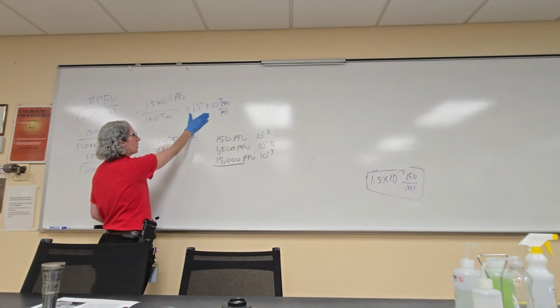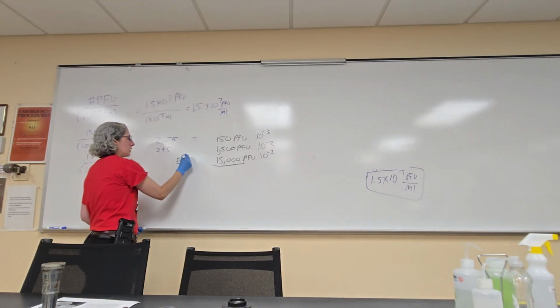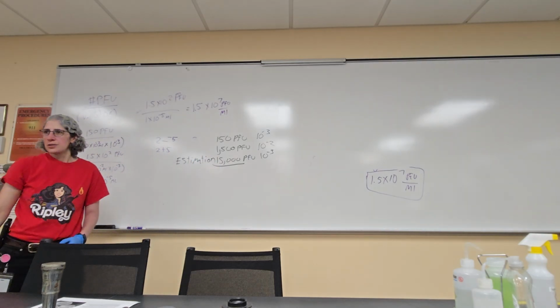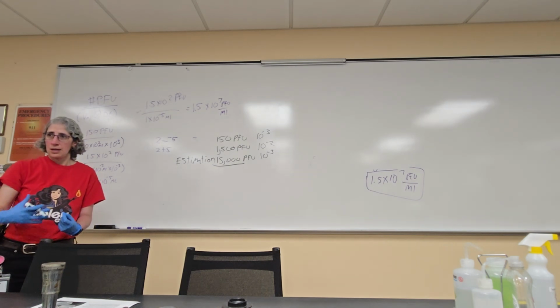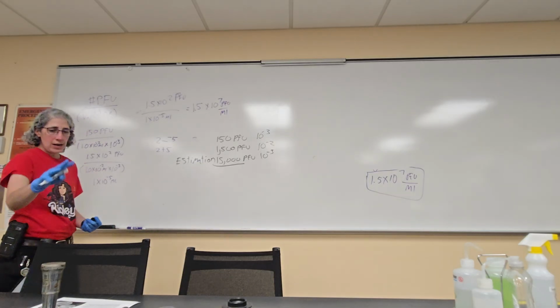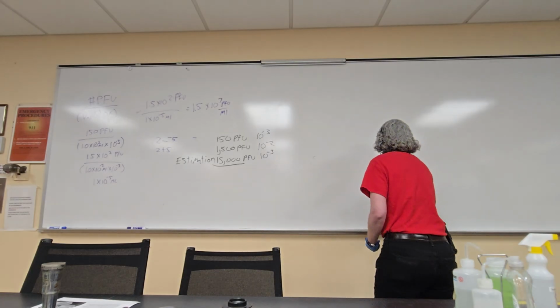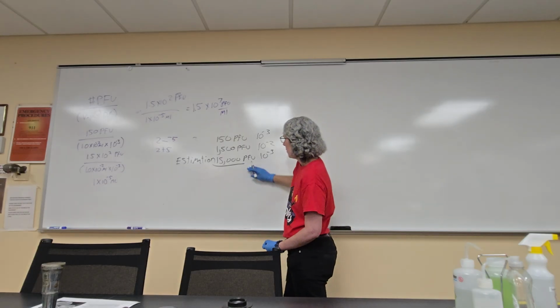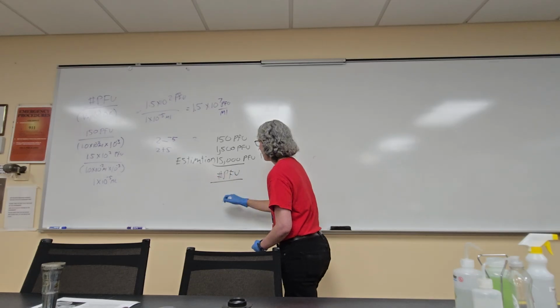So we've got our titer, and we've got our estimation of the number of plaques that we need. So now we can figure out what volume is needed, okay? What volume is needed in order to create that webbed plate? So what we can do is take the number of plaque forming units that are needed and divide it by your calculated viral titer.